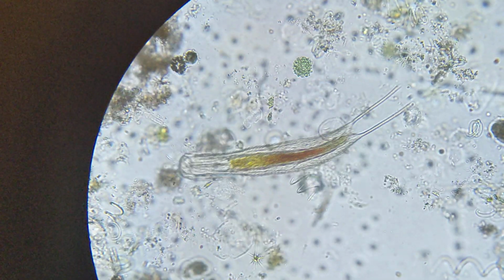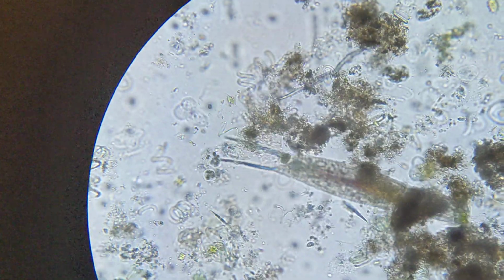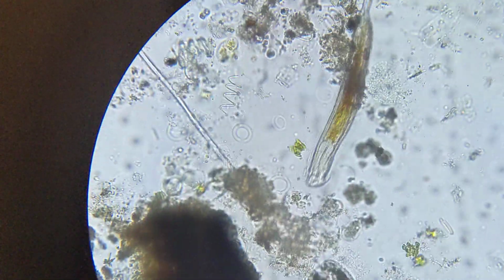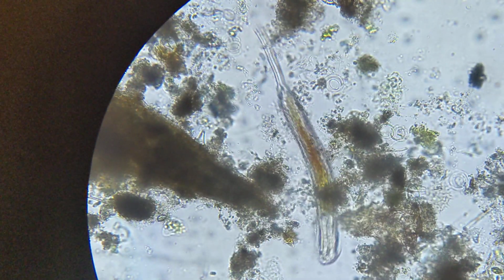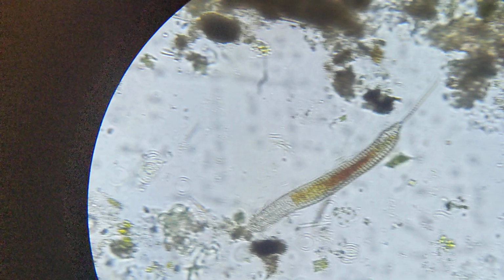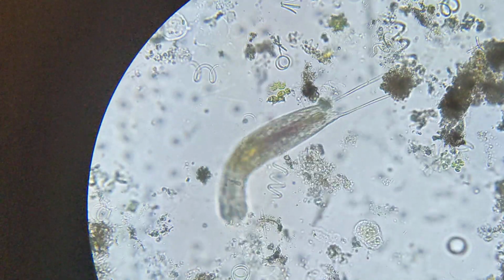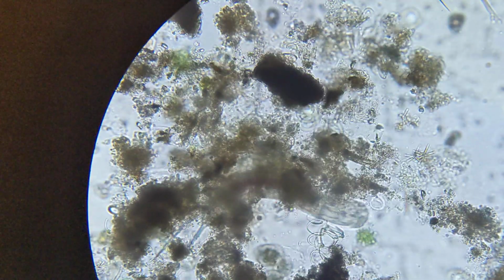And they do that by hitching rides on drops of water, and some of them can be evaporated into clouds and then rain down elsewhere. Some of them can stick to the fur and scales of animals that go for a swim. And then the animal goes out of the pond and into some other pond, and now the microbe is over there. They can get caught by the wind and just whipped out of the water and blown away into some other environment. And so it's not a surprise to me to encounter something in Morningside Pond that I've never seen before. But I have no idea what this is.